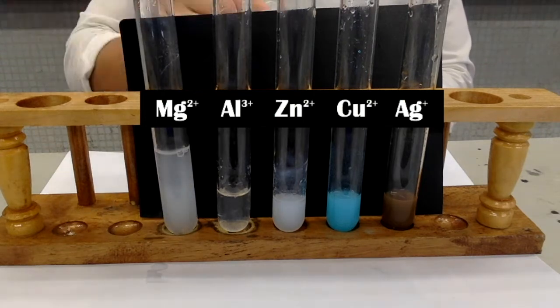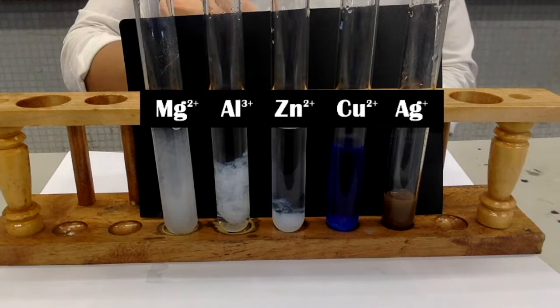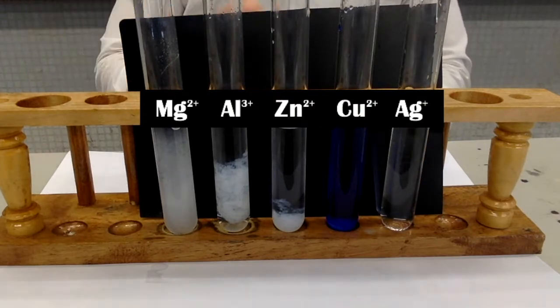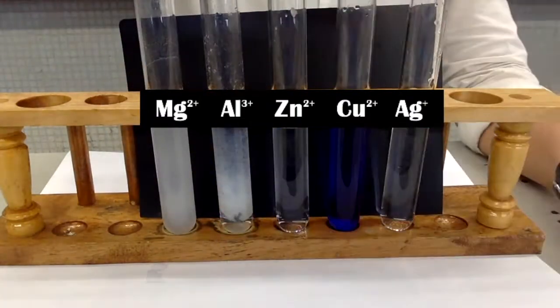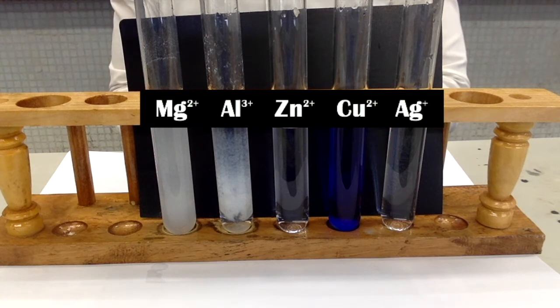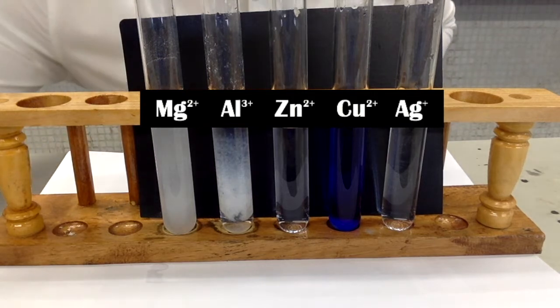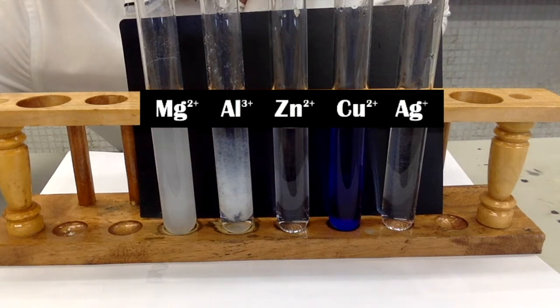Excess ammonia solution is added into each sample. White precipitate with magnesium ion and aluminum ion remains undissolved. White precipitate with zinc ion redissolved. Blue precipitate with copper 2 ion redissolved, and it forms a deep blue solution. And lastly, the brown precipitate with silver 1 ion has redissolved to form a colorless solution.